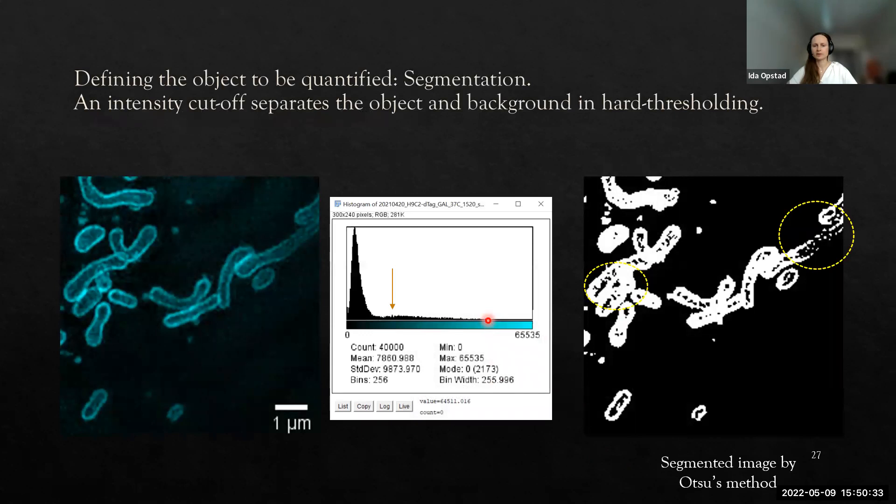The first thing we can do is compare with hard thresholding. To quantify anything in the image, we need to clearly define the object we want to quantify. The simplest method is just to have a hard thresholding method where intensities above a certain threshold are counted as objects and below are counted as background.